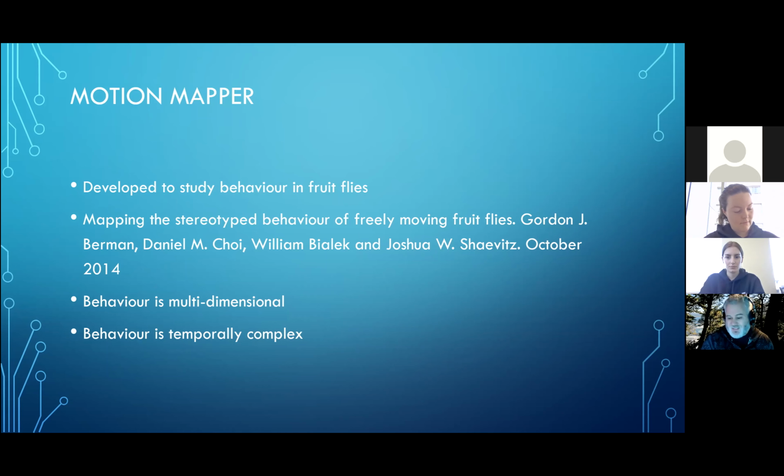So in that example, the hind limbs might be moving very slowly or not at all. The forelimbs are moving quite rapidly as the animal grooms, and say a point like the head is moving more slowly. And so you've got this relationship of various features that you're tracking moving at different frequencies, and you can use that as a way to identify a particular behavior.